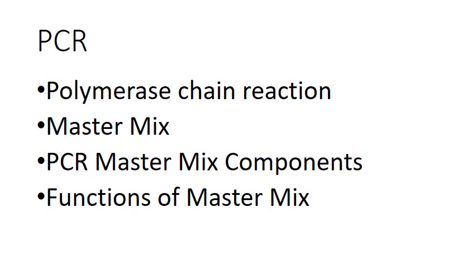Let's go back to an earlier time. We were talking about stuff earlier in the section, about PCR, the polymerase chain reaction. We said that this polymerase chain reaction is just a series of heating and cooling steps. We didn't get into any fine details as to what was going on in the PCR reaction.